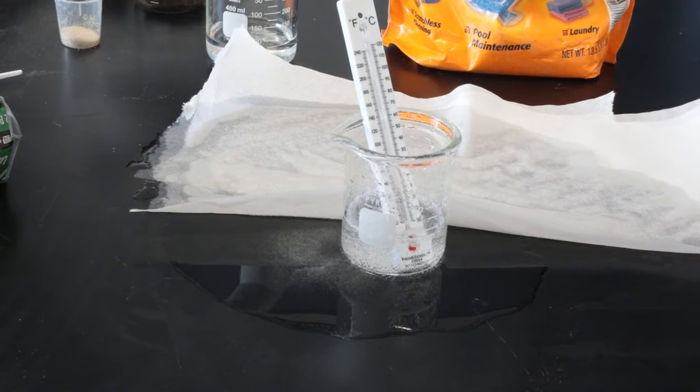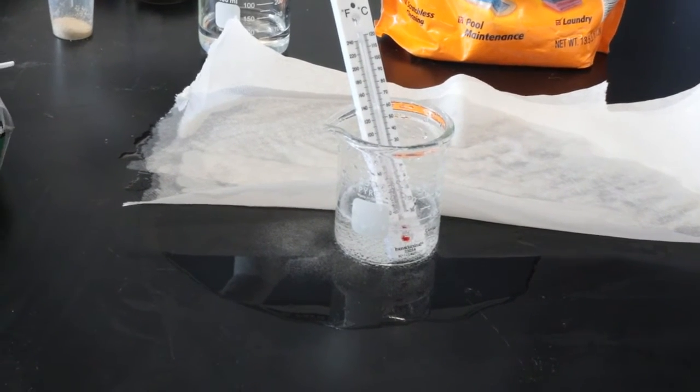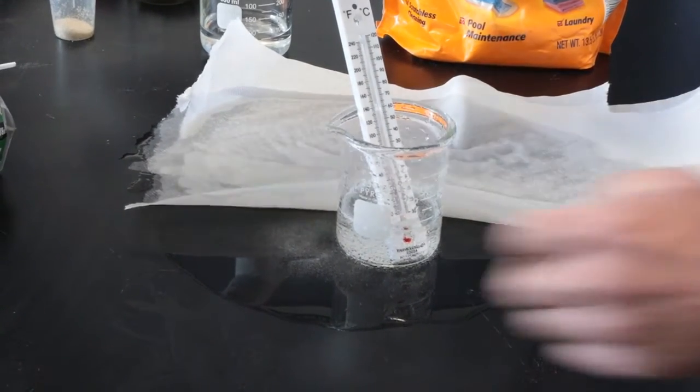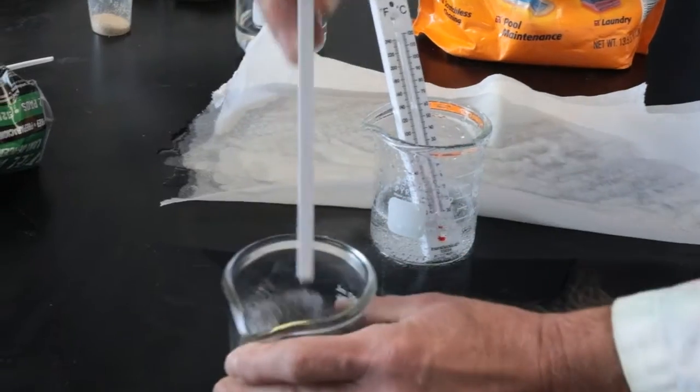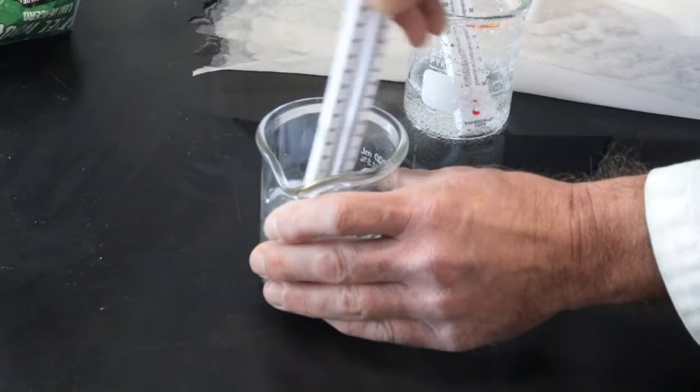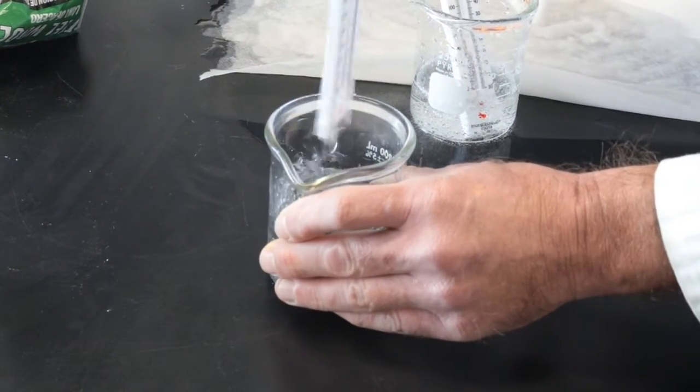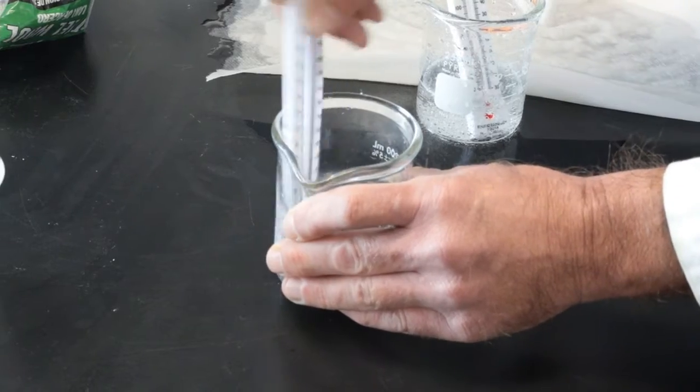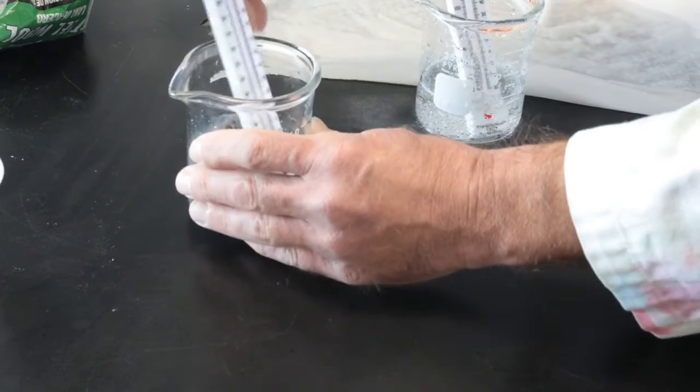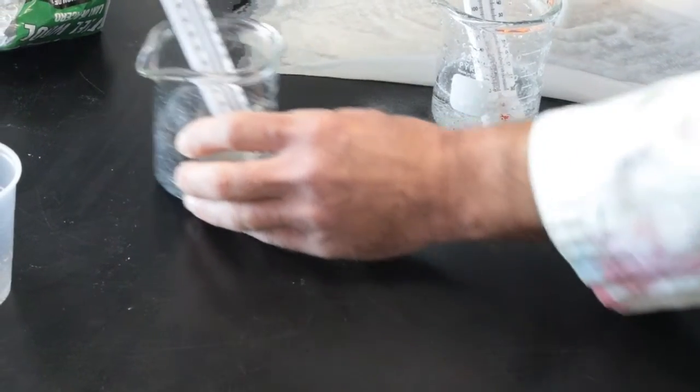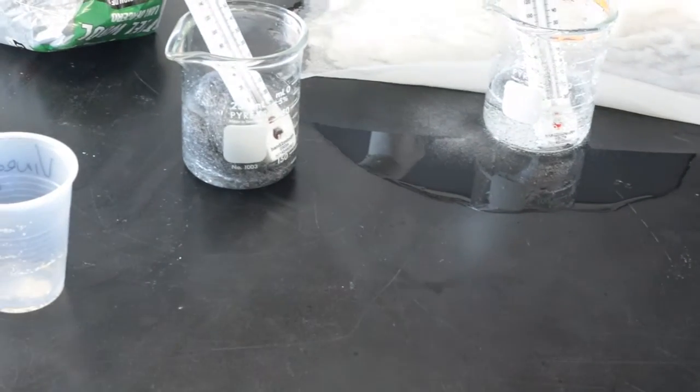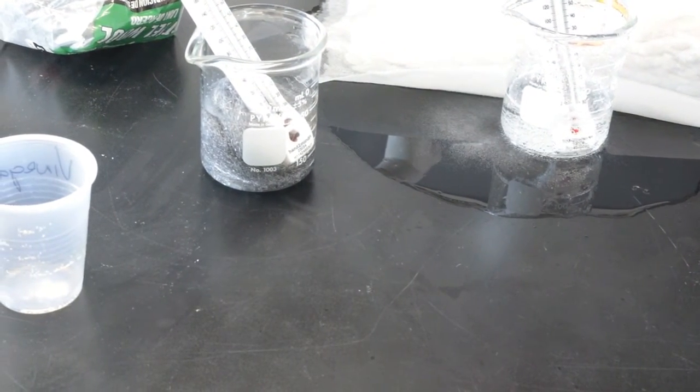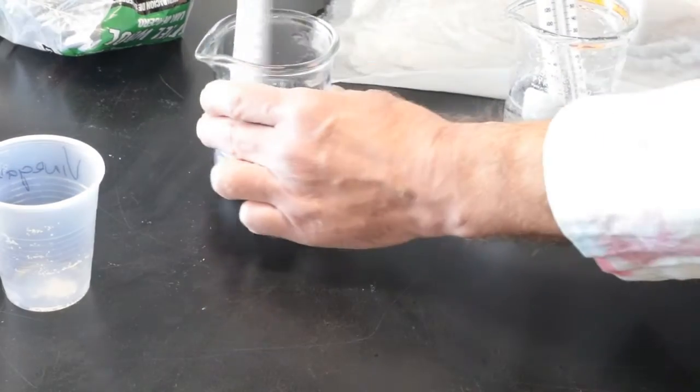While we're waiting for that, Dave, take the steel wool and swish it around with the thermometer. You can use steel wool, this plain, or you can use a Brillo pad. It seems to work the same amount. What we're doing is we're taking the oil off the steel wool using acetic acid to do that.